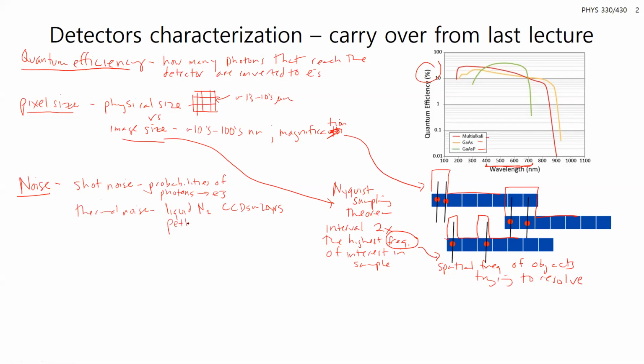More common, people use Peltier devices to control the temperature. And you also might see liquid cooling or fans to help keep the thermal noise down. But be aware that liquid cooling or fans can also introduce vibrations.